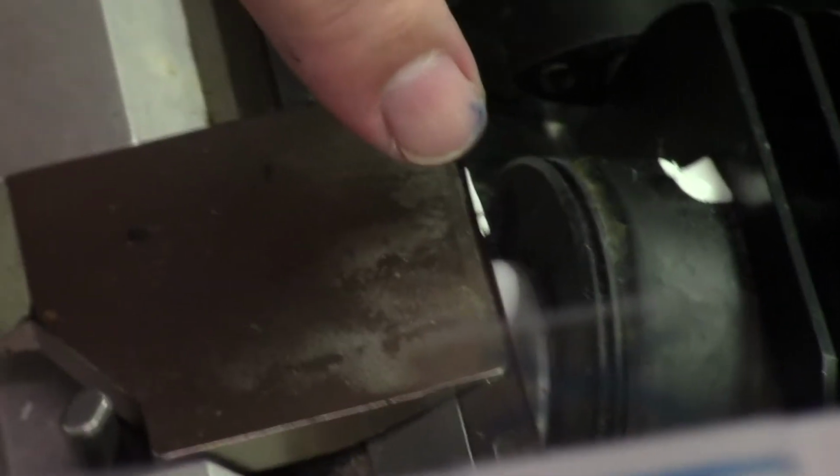But notice there's a black line in there. Do you have enough zoom you can see the black line? Right there. That's our piece of stump tissue. And that on either side is just OCT. There's no black line over here, so we're not into the regenerate tissue yet, but we're already into the stump tissue.